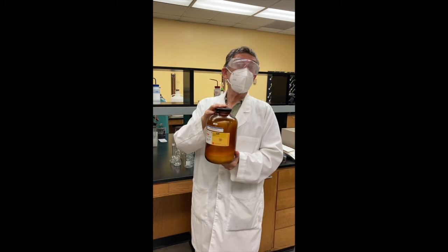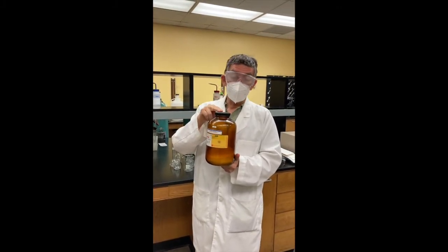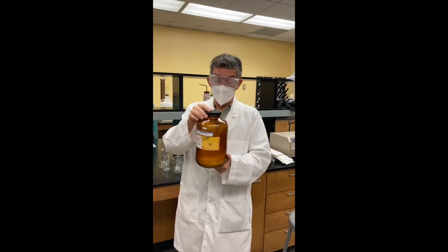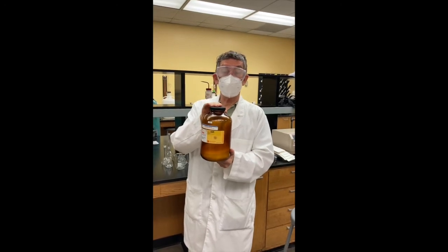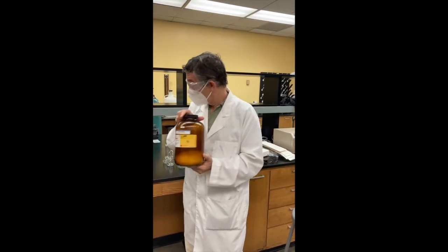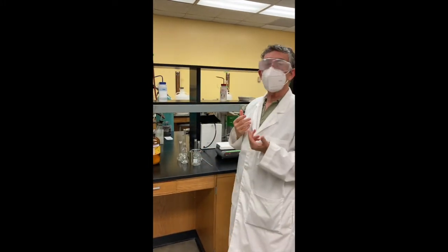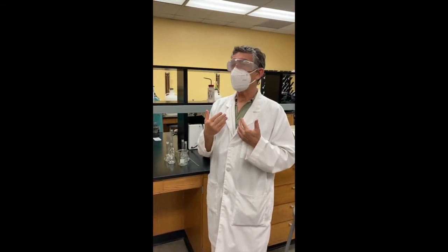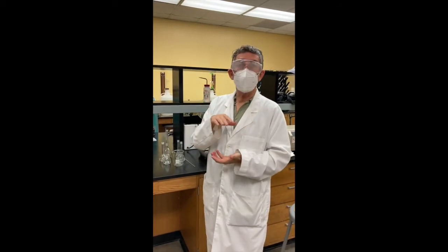And it's important to know about these reversed linkages because the physical properties of your polymer may be sensitive to how many of the linkages are reversed. So we will also figure out the fraction of reversed linkages. So that's our goal. And to do this, the physical property we're going to monitor is called the viscosity. The viscosity is essentially how thick a solution is. If you think of honey, it's very viscous.